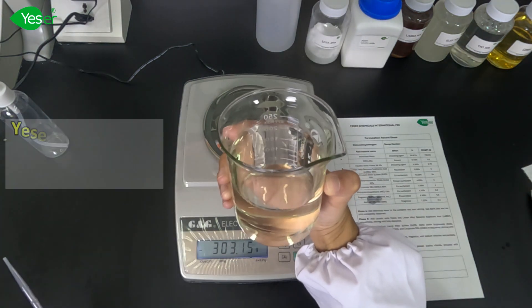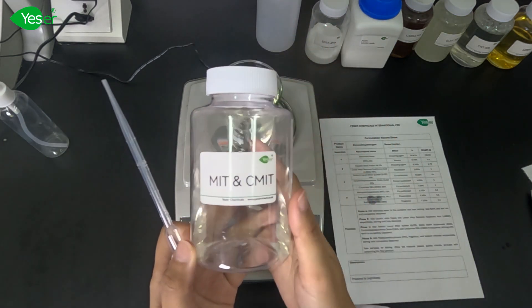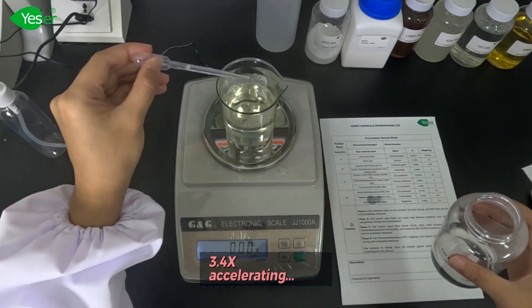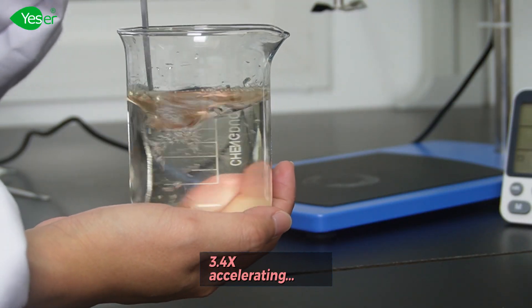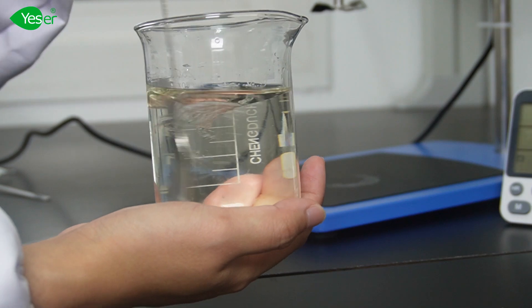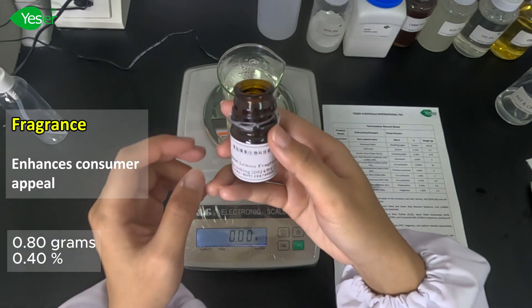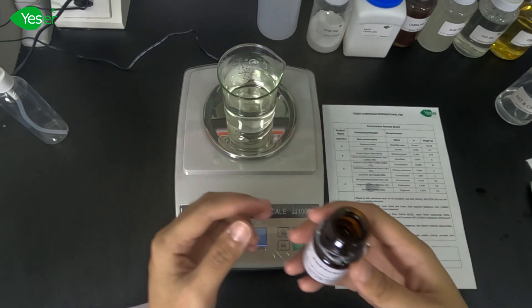Now that all our surfactants are completely dissolved, we are heading to our preservative, which is MIT. We will weigh about 0.1%, or 0.2 grams for the solution. Next is our fragrance, which will enhance the consumer appeal of the product. We will weigh about 0.4%, or 0.8 grams for the solution.